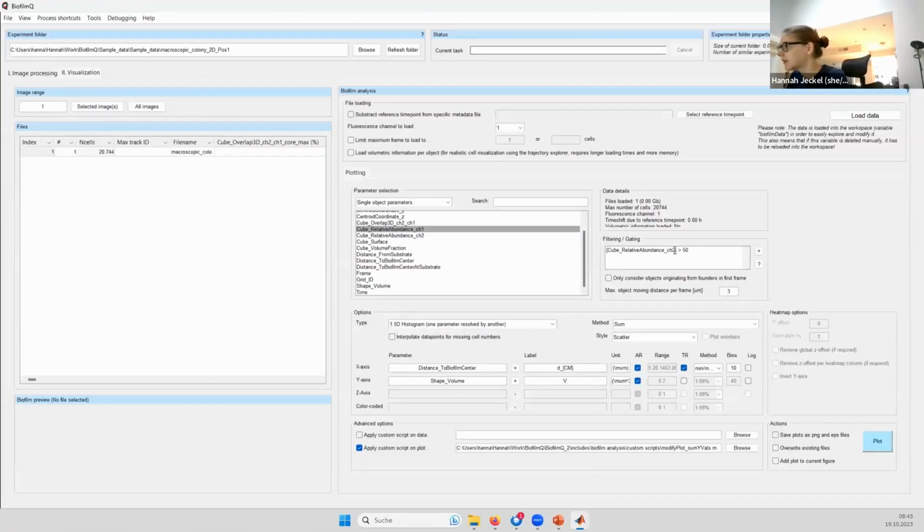All right, so let's start again with channel 1. And we are going to plot it. Let's see if we have everything right. This looks fine.